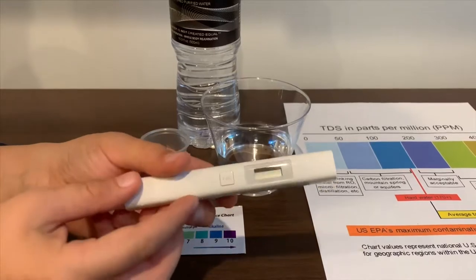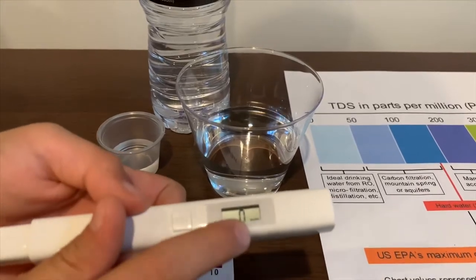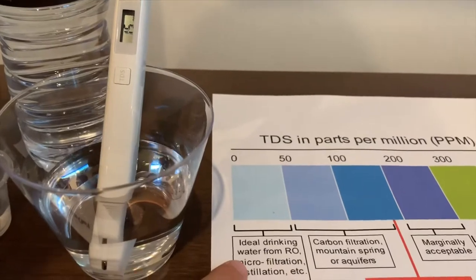If you want to buy this TDS tester, check the link down below. Turn on the TDS tester, make sure it says 0, and put it in. The reading is 15 — that is ideal drinking water.